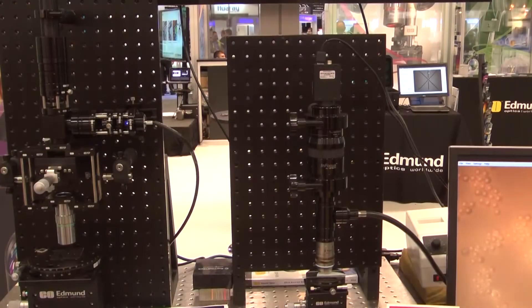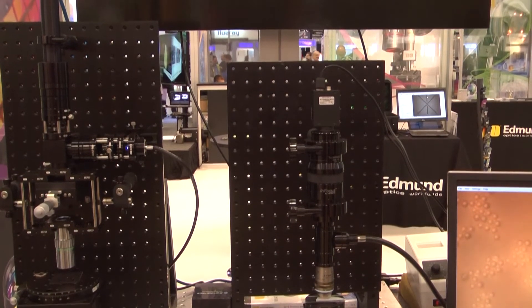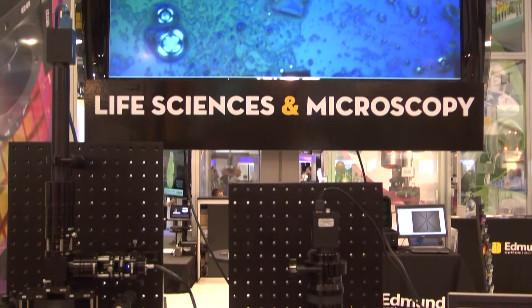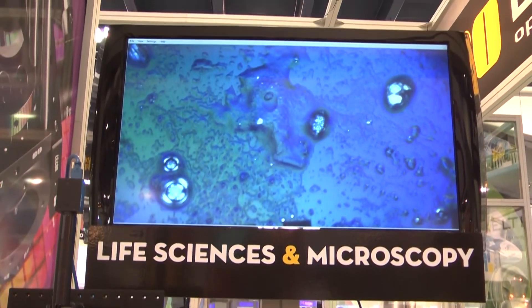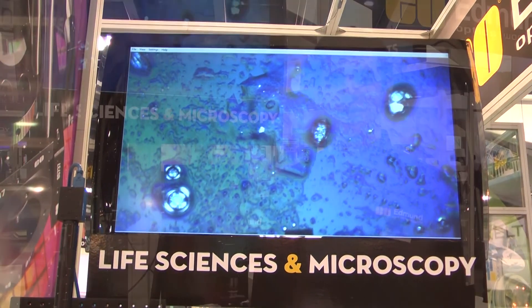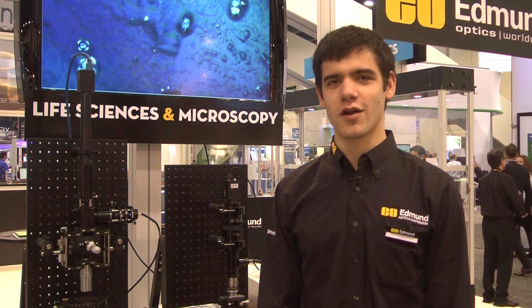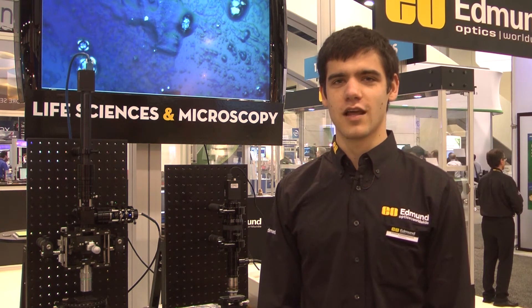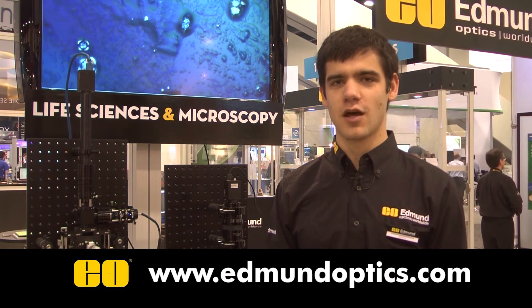A commercial DIC microscope costs anywhere from thirty to forty thousand dollars, and this microscope designed with our stock products is considerably less expensive. For more information on this microscope or on any of our other products, please visit us online at www.edmundoptics.com.